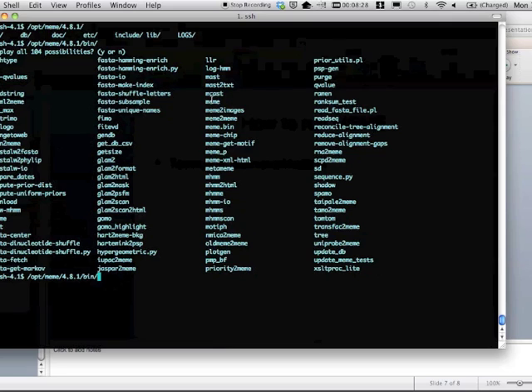and in some cases, some of these programs are just run by programs such as meme. So meme can use meme-to-images or meme-to-meme, that sort of thing. So you won't necessarily use them, but meme can use them. So we'll use things like meme or meme-chip or dreme. These might be things you're interested in. Another good program to learn how to use or to look at is MAST.